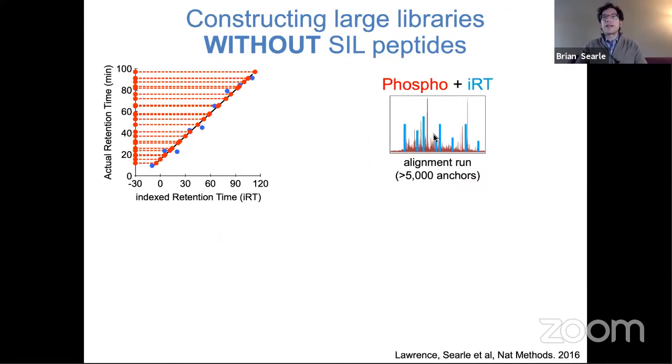Another way is something that Rob and I explored in this phosphoproteomic experiment. And I think this is an important thing to work through because it enables you to start to think about building libraries from data that you already have. So we had acquired a whole bunch of data already. And in this particular case, we have a particular sample that we were interested in monitoring. So this was a phosphopeptide sample that we stuck these IRT peptides into. And again, these were the Pierce peptides.